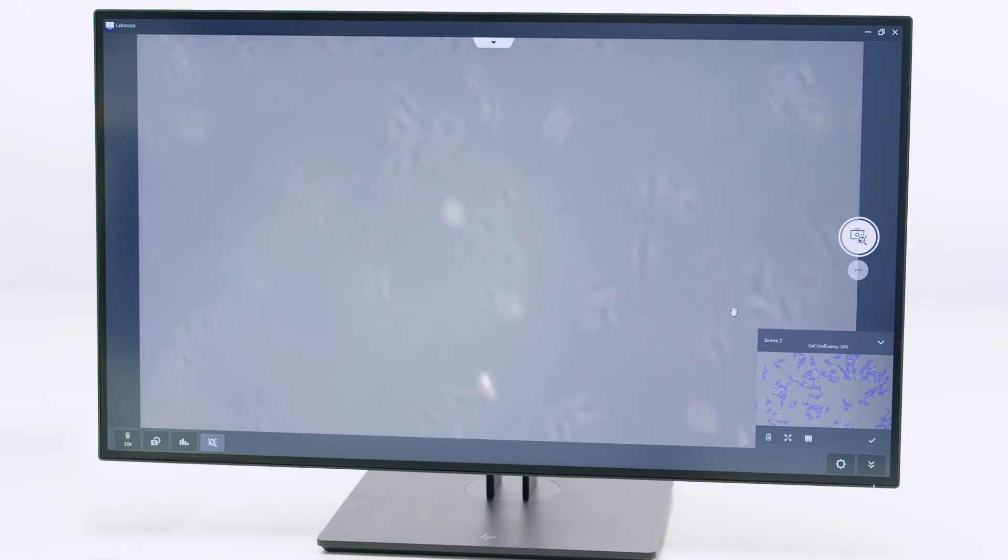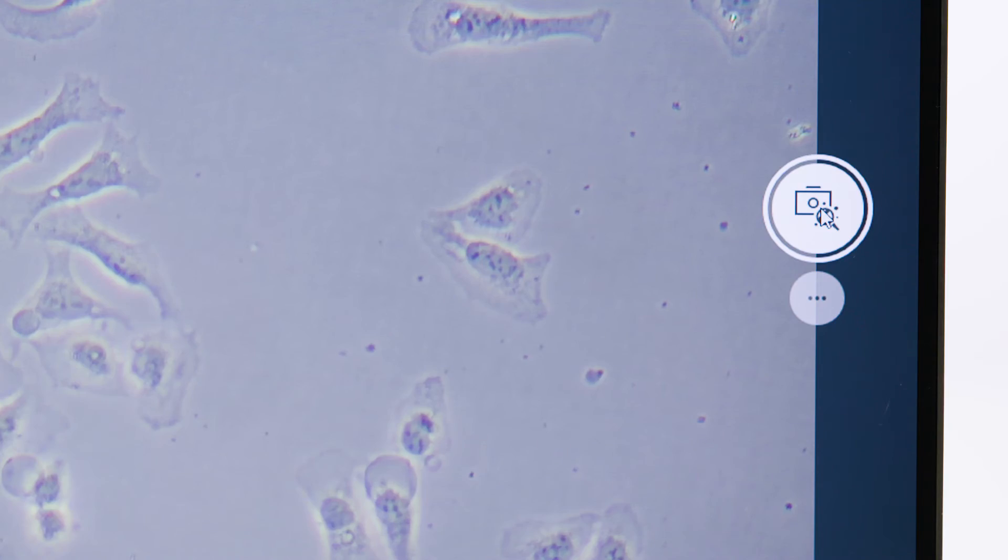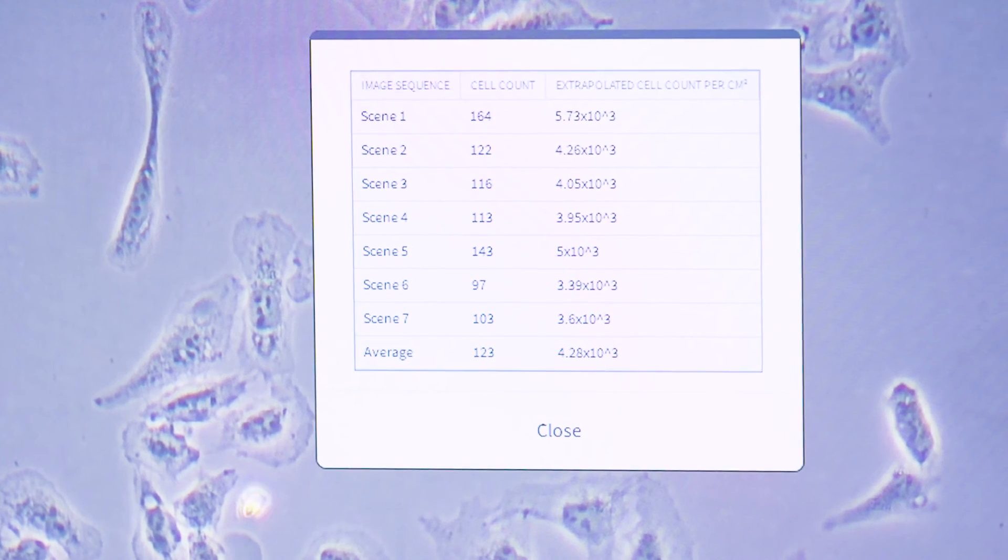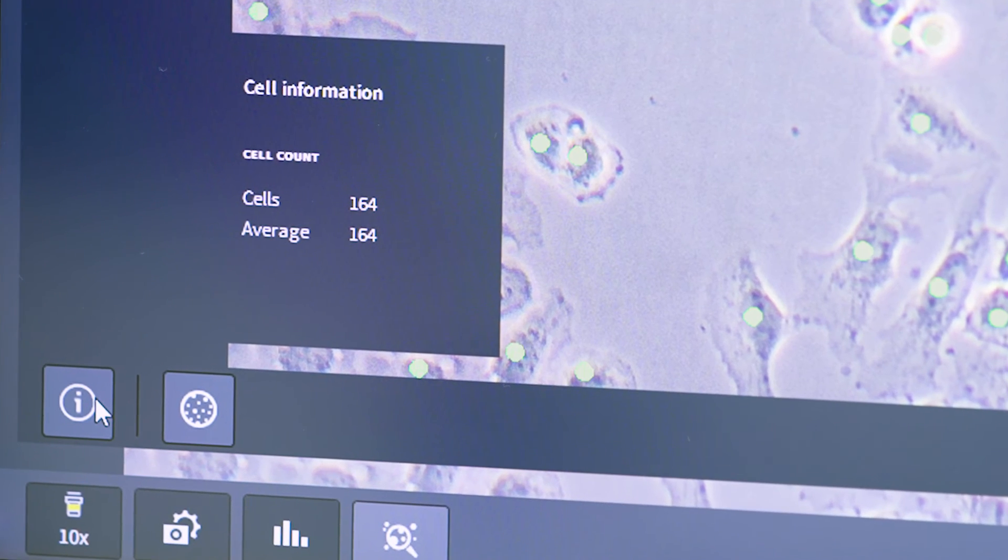You can take images at multiple positions in your dish to accommodate for inhomogeneities. The software then provides the average cell count per area for your cell population at a glance.